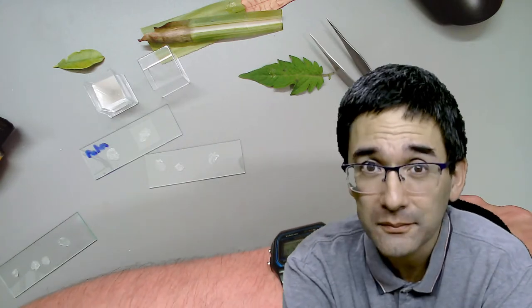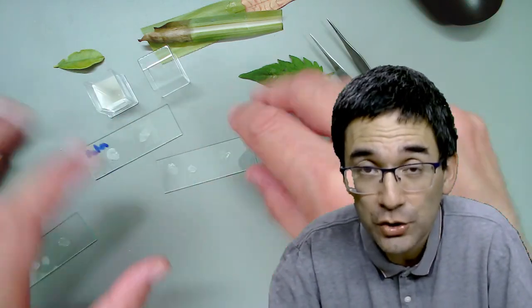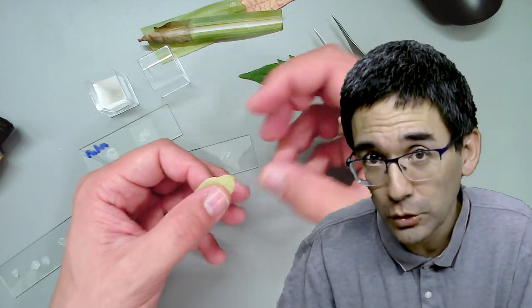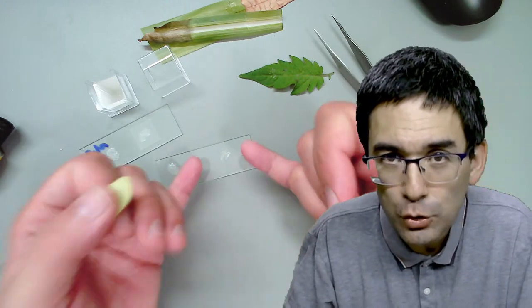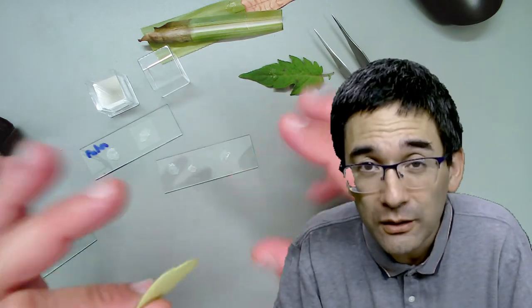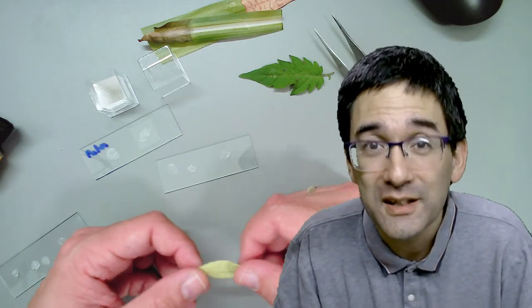Euparal is a mounting medium very commonly used especially by people who mount insects. Euparal has a significant advantage in that you can take a specimen, put it into alcohol to remove the water, then directly mount it in Euparal. Many other modern mounting media don't allow you to do that because a little bit of remaining water can cause clouding. Euparal is also comparatively safe because you're not messing around with poisonous organic solvents like xylene.